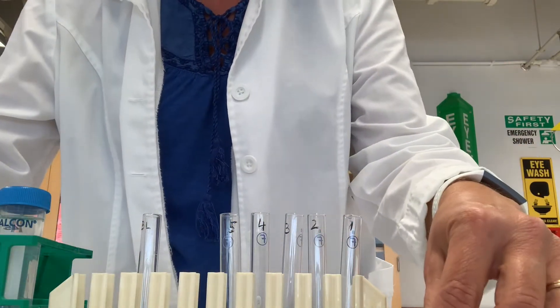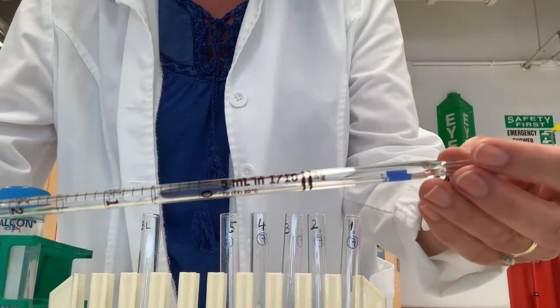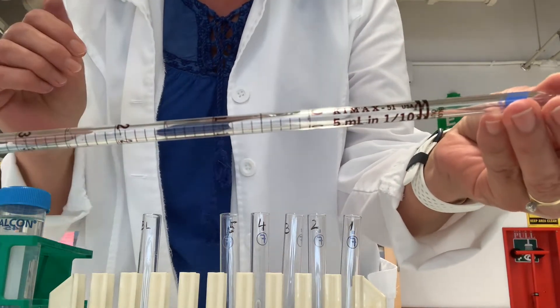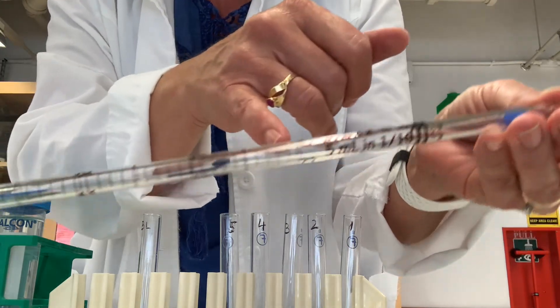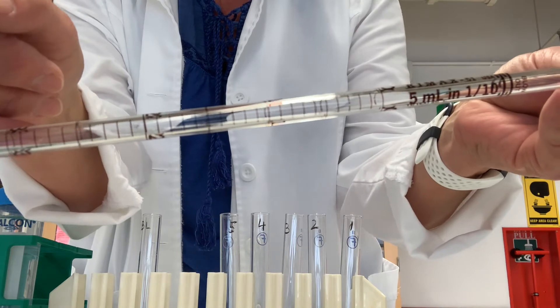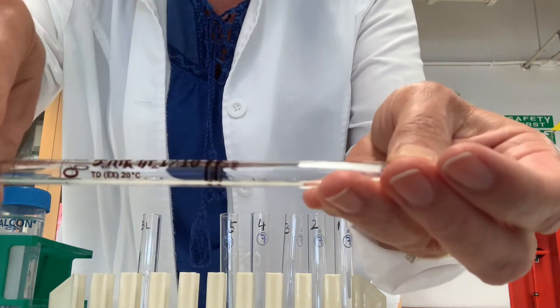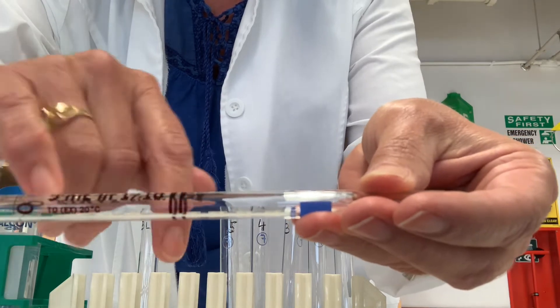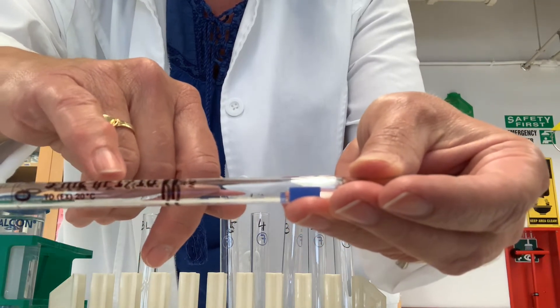Before we get started, I wanted to show you how pipettes are calibrated. This is a standard serological pipette made out of glass. If you notice the graduations, they run from zero down to the tip. This particular pipette will pipette five milliliters in total volume, and it is graduated in increments of one tenth of a milliliter.